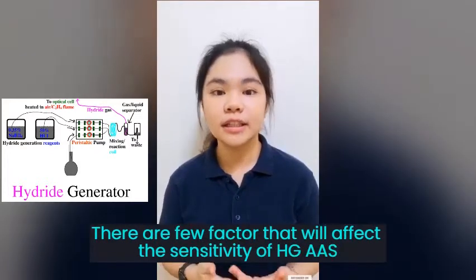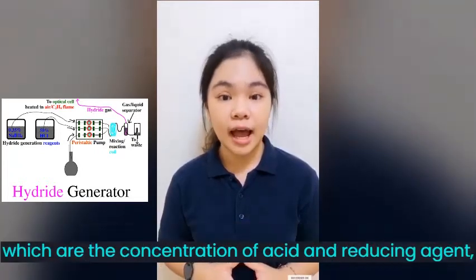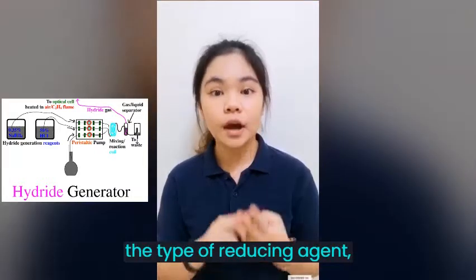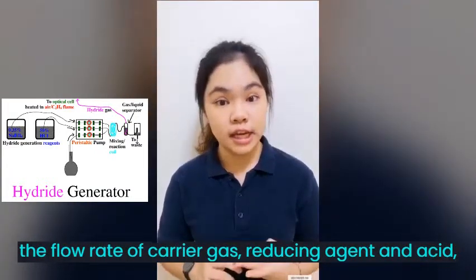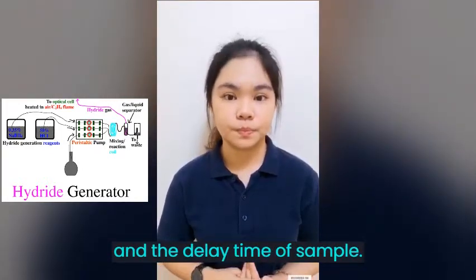There are a few factors that will affect the sensitivity of hydride generation AAS, which are the concentration of acid and reducing agent, the type of the reducing agent, the flow rate of carrier gas, reducing agent and the acid, and the delay time of the sample.